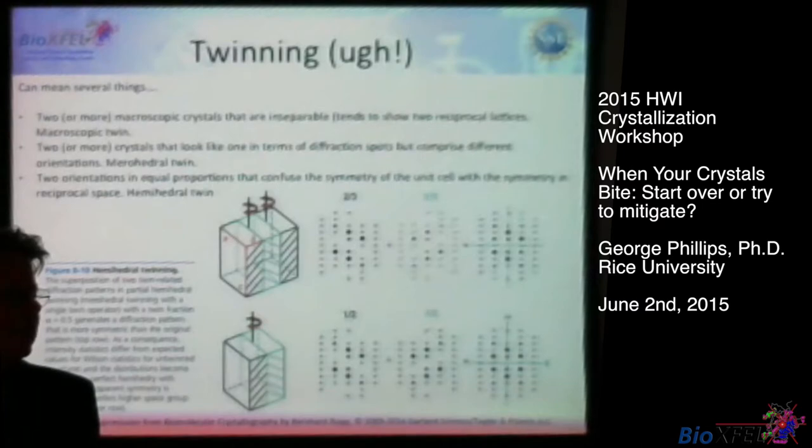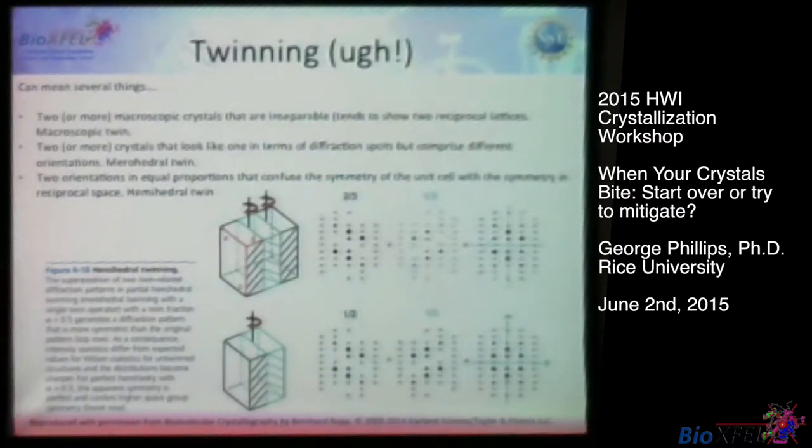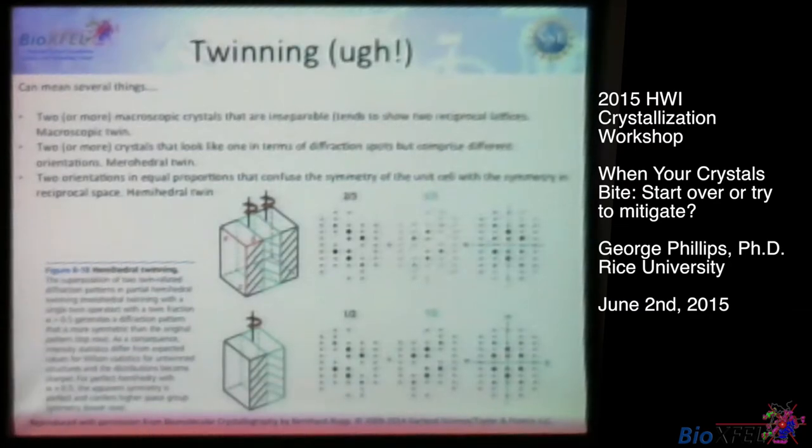So all data which have been evaluated with the CTB test are perfectly twinned. Right. And when you do the L test, they appear to be twinned, and they have to be evaluated. So I would argue that that's crystallographer-induced twinning. That's when the crystallographer bites instead of the crystal biting. So it could also be that this was perfectly fine, but the program or something affected the data. Exactly. So we can't blame the crystal for that one, though. That's just a property of the space group.